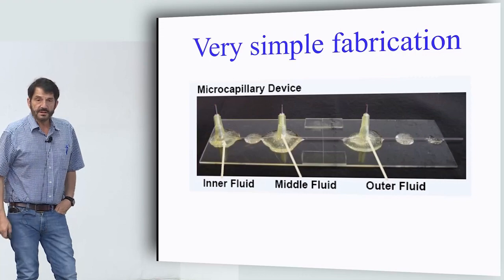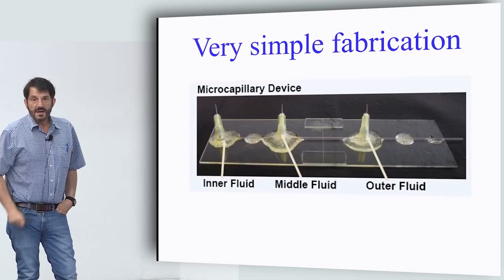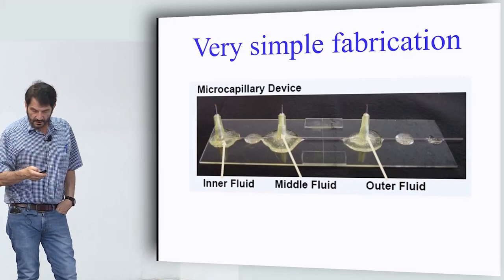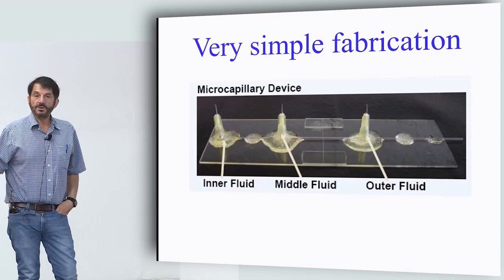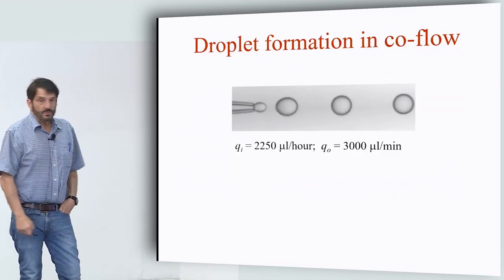This is what a device looks like. A device like this and much more complicated devices that I'll show you in a couple of minutes can be made in roughly half an hour by one of the skilled students in my group. It's all held together with our favorite material. I told you we like simplicity, so it's all held together just with 5-minute epoxy. And this is what it looks like.